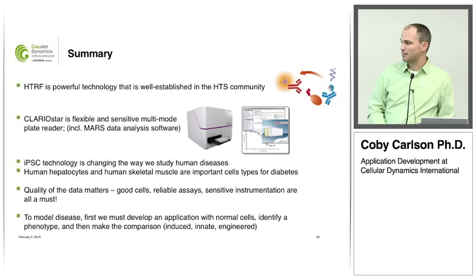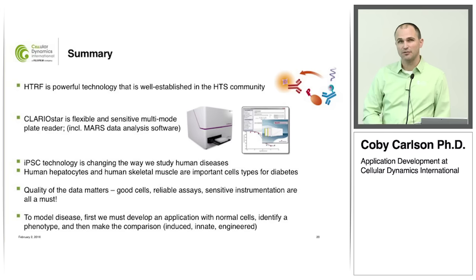And again, the idea for what we do in our group is we want to try to develop applications with normal cells and then be able to plug in the mutant ones and see the comparisons. I think it's a really simple thing, but the comparison of this induced, innate, and engineered disease modeling approach is really, I think, a good way to do this.